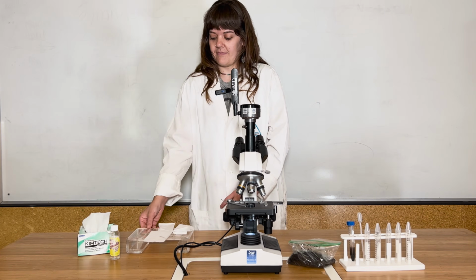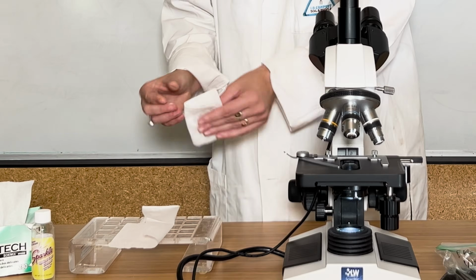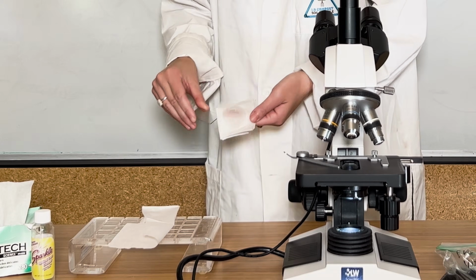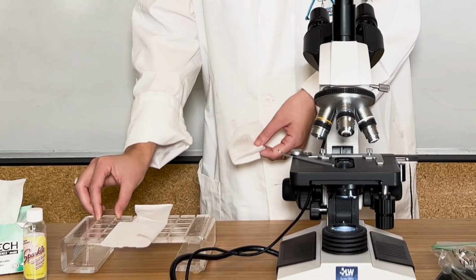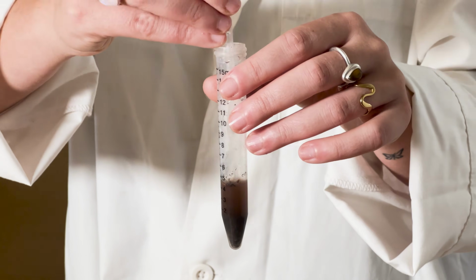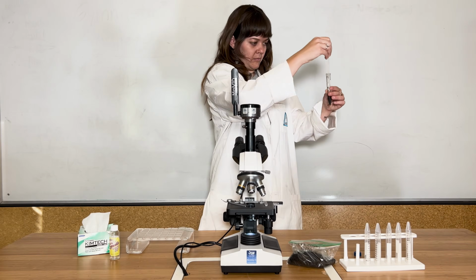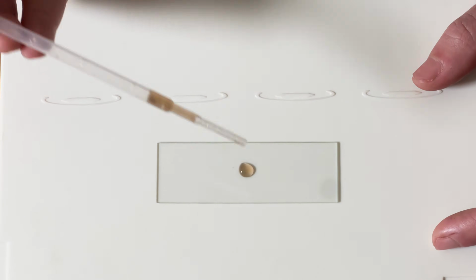Prepare your glass slide and cover slip by cleaning them with a lens wipe if needed, and placing them on a clear, easily visible surface. Be very careful when handling your cover slip since it is made from thin glass and can break easily. Use a plastic pipette to collect roughly 1 milliliter from the top of the test tube, just below the organic matter layer. Place 1 drop on the center of the microscope slide.